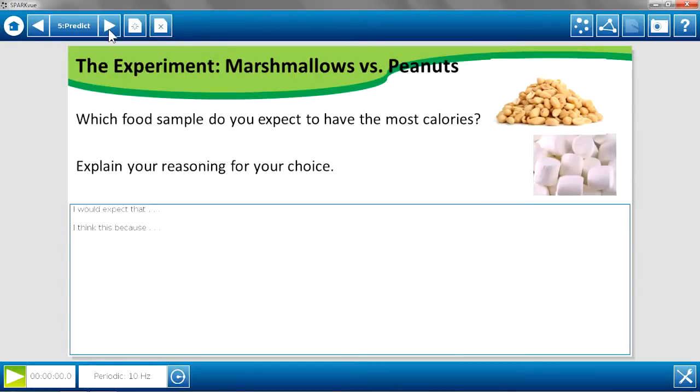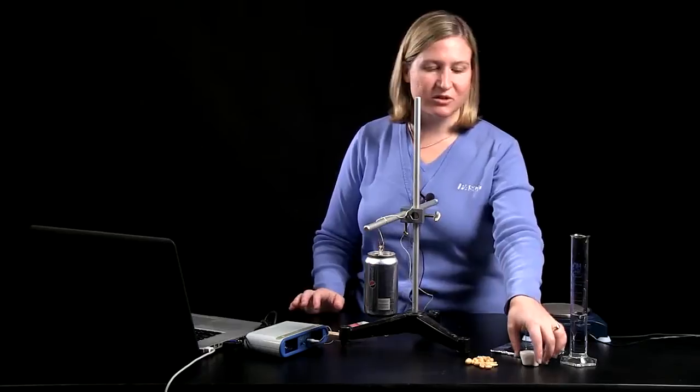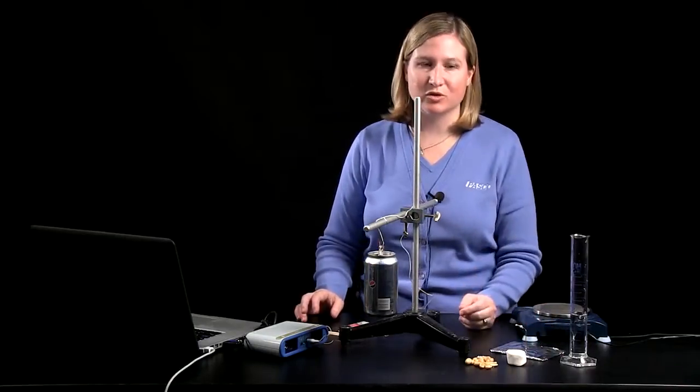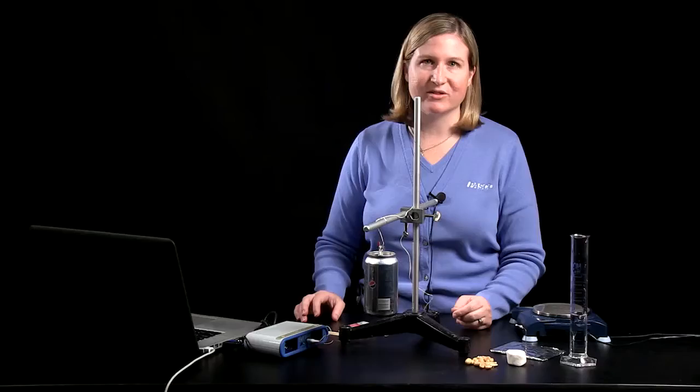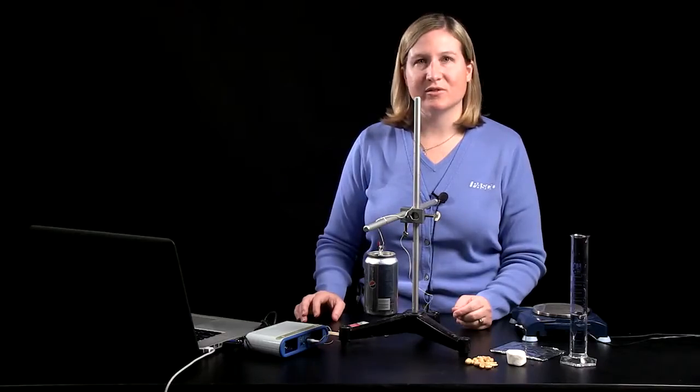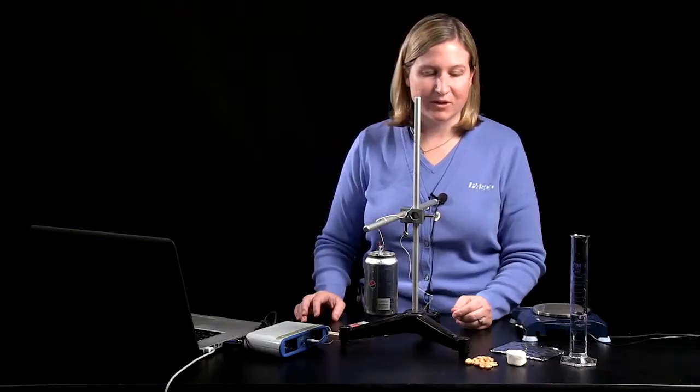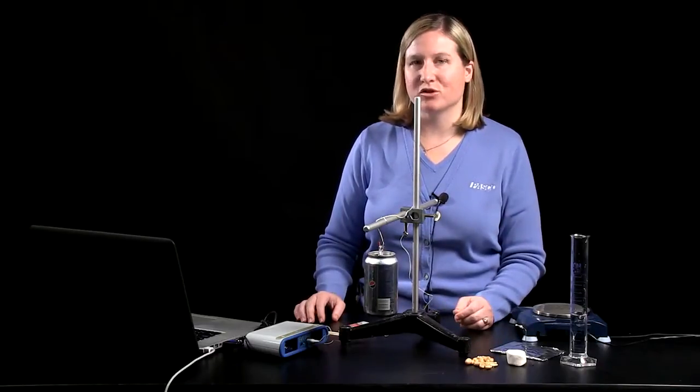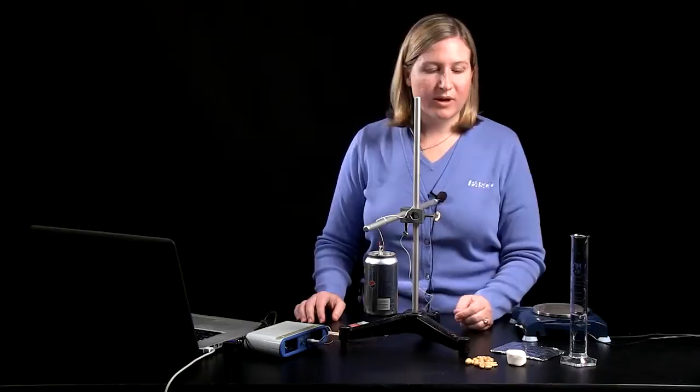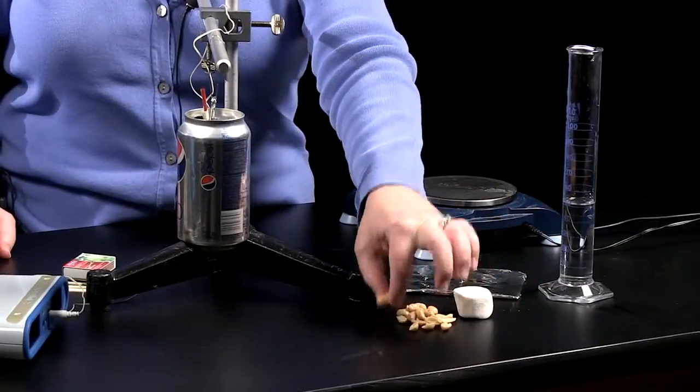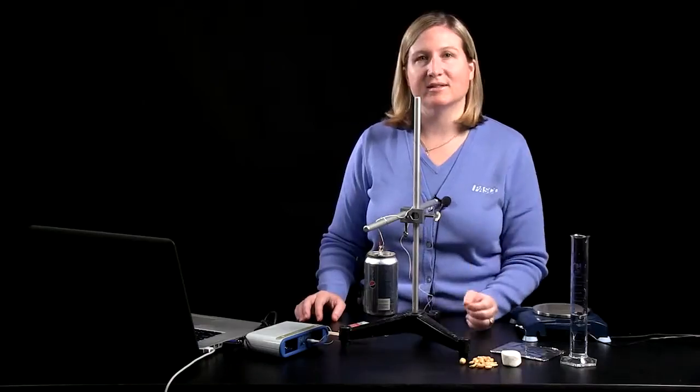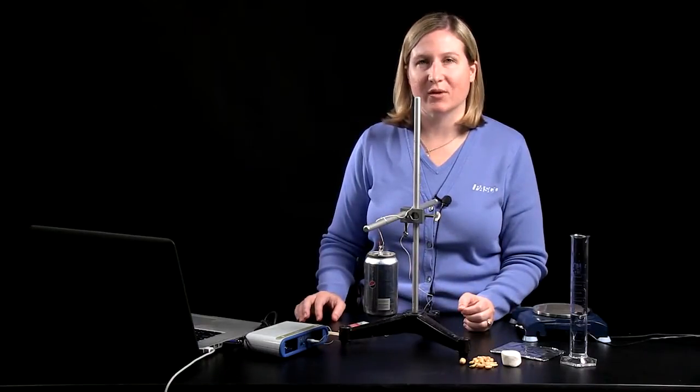So the two foods that we're going to burn in order to compare their energy content are peanuts and marshmallows. So you can just use standard marshmallows and peanuts from the grocery store. It's good to keep the packaging that they come in so that students can then compare the results of their lab to the nutrition labels that are on those packages. But don't let the students see those nutrition labels to start with. You want them to make a prediction, the marshmallow or peanut, which one has the most energy content, the greatest number of calories.